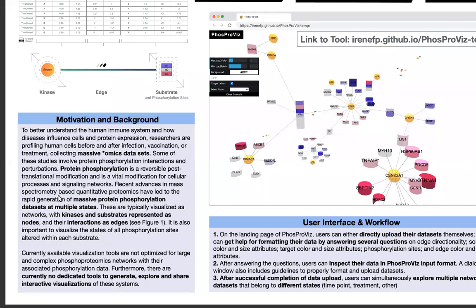One specific user who had programming experience used a scripting language called Perl to threshold and color code his data. Even though the user had scripting experience and was able to automate some parts of this process, it took him several weeks to generate a visualization that fit his needs, and the process was described by him as a nightmare.